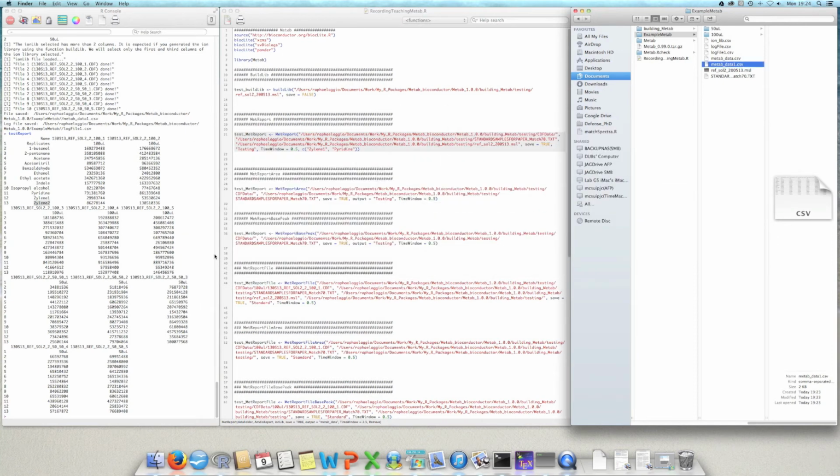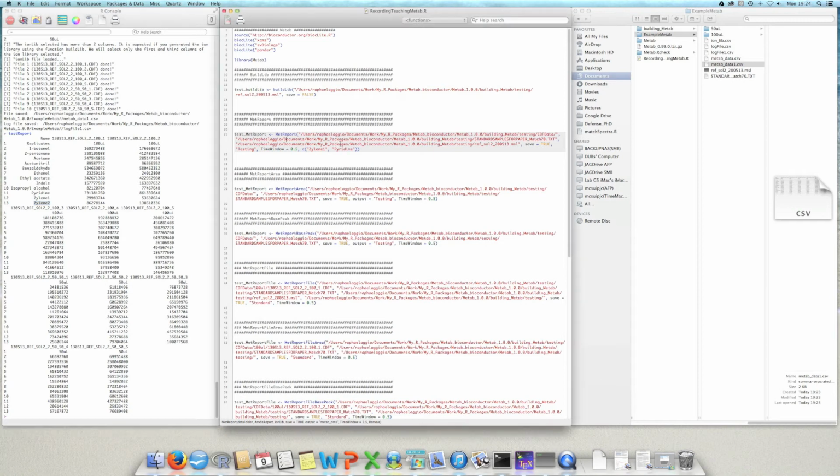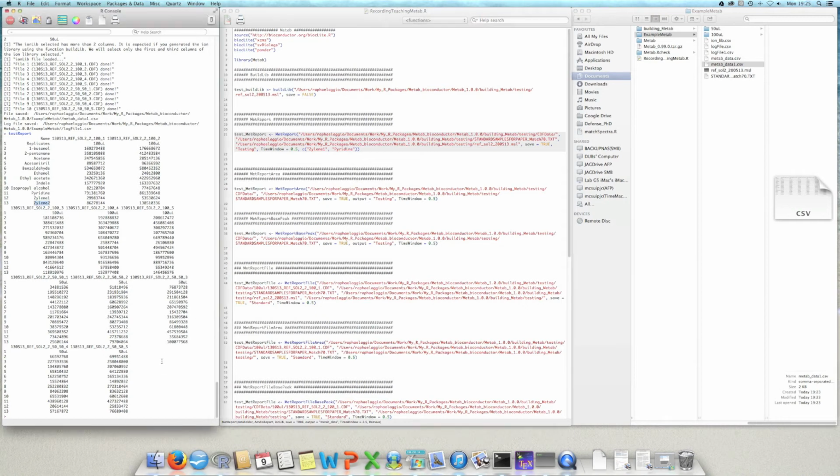So Metab gives you this option to analyze, to point and click in the files that you want to use, like the MetReport, the folders, the library, and so on. However, it's quite time consuming anyway. So the best way I suggest is actually to tell the function where the file is beforehand, like this. So here, instead of point to the file, I can just say the MetReport.